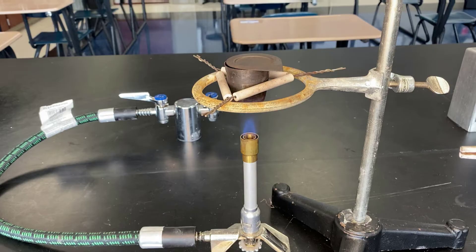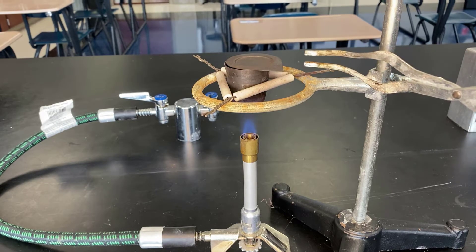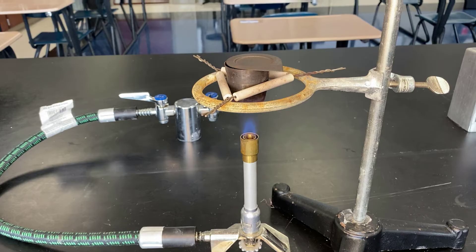and turn off the heat source. I can then hope that I wait long enough for it to cool. Again, we need fresh, new oxygen to come in and contact with the magnesium so that we can get magnesium oxide.